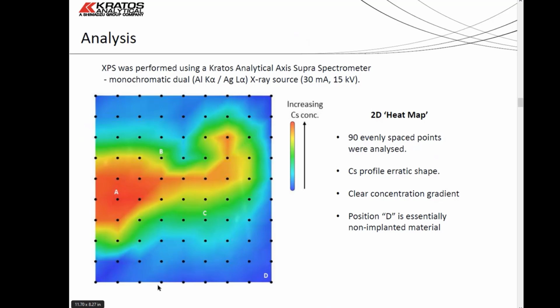So down in the corner, no cesium ions hit down there. So we looked in different areas, and you can see that the distribution of the ion bombardment process that he'd performed wasn't uniform across the surface. So where exactly are you looking? What is your sample then? It becomes a complicated question, really.